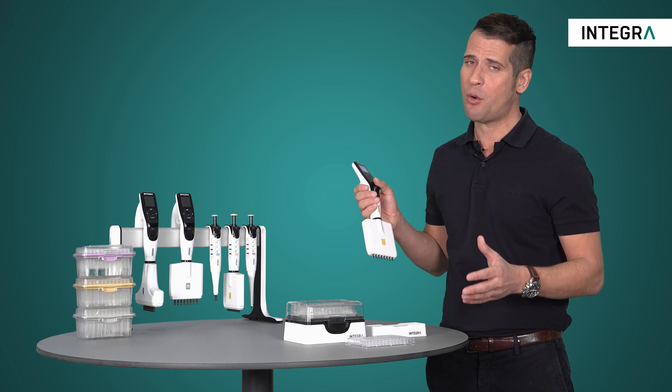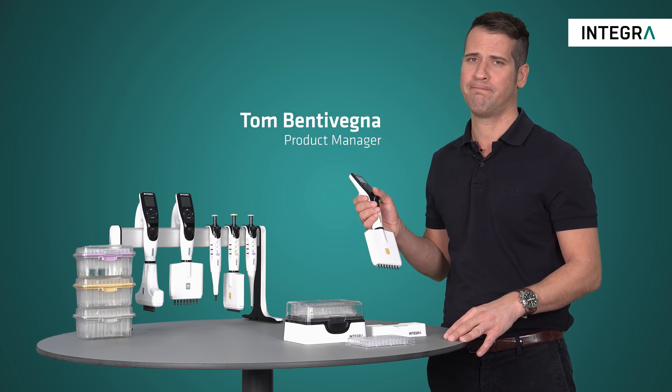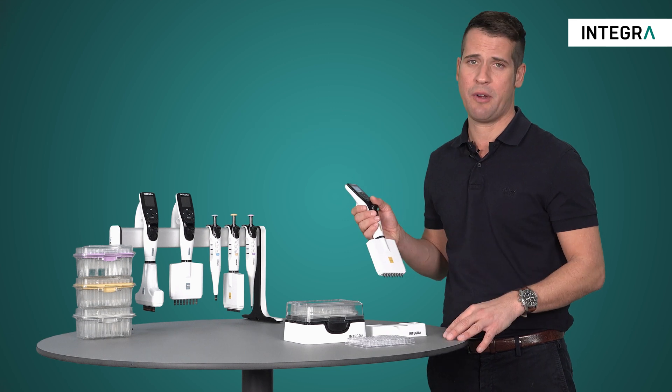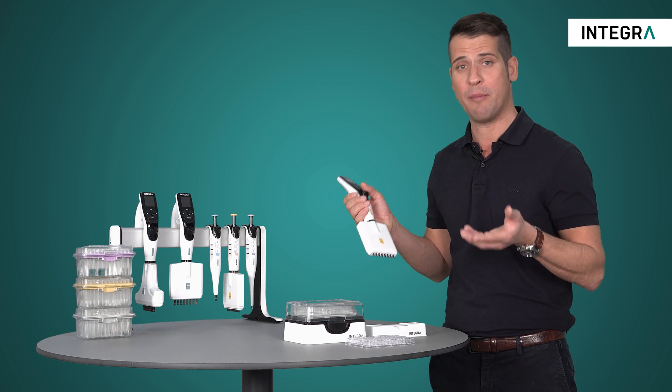Mixing with manual pipettes can be quite tedious and it's not very easy on the finger, hand, or thumb. With electronic pipettes, however, not only are they more reproducible, but all it takes is one button.